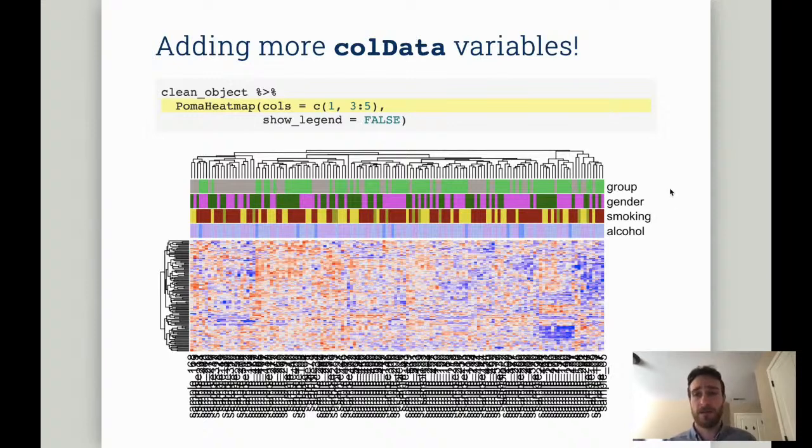Actually, maybe this is not a great example, because as you can see, it's very difficult to cluster our samples within clear groups. So we don't have a clear separation in here, maybe here, but anyway, maybe it's not the best example, but it works anyway.